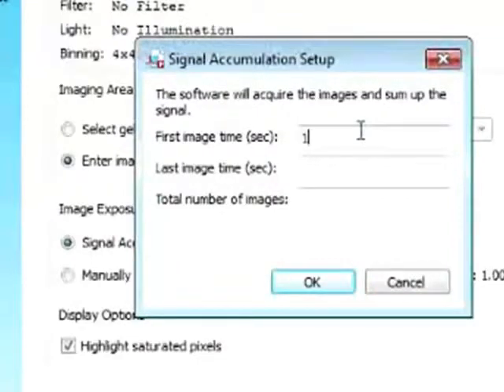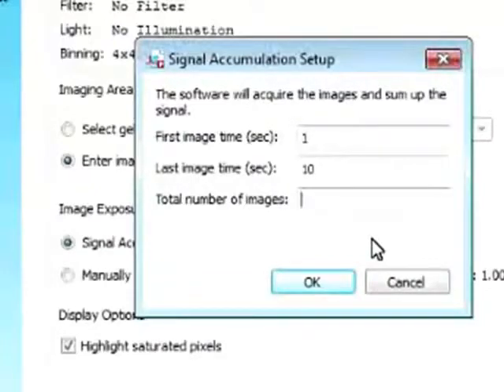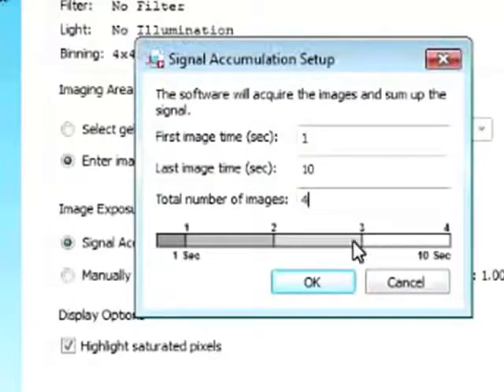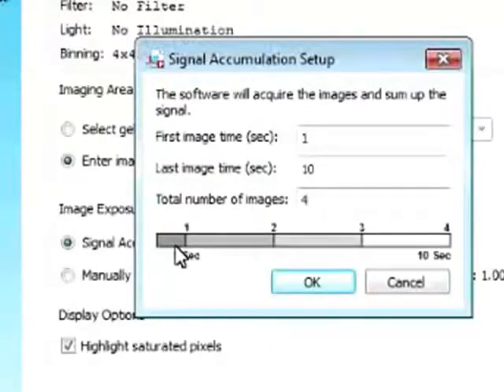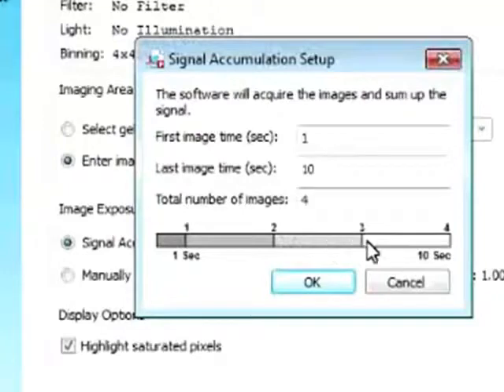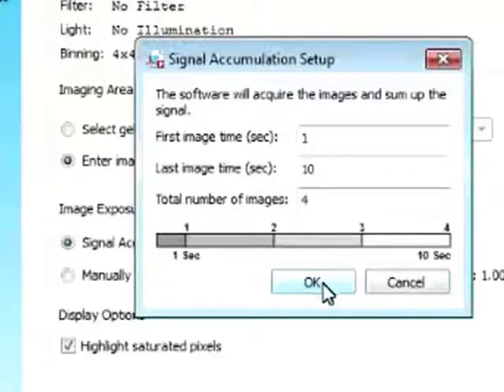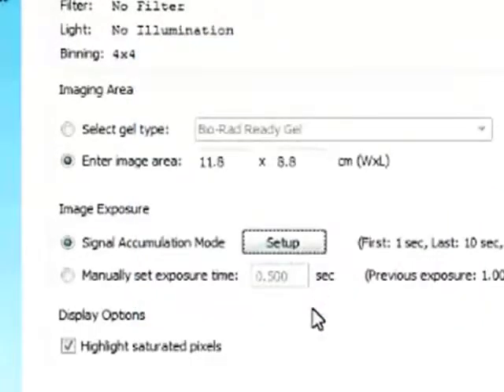So we can set it to, say, one second. And the last imaging time we can set to ten seconds. And the total number of images to take I can select four. So now the first image will be taken at one second exposure, the second image will be taken at four second exposure, the third image at seven seconds, the fourth image at ten seconds exposure. So this is a really nice tool that can be used.